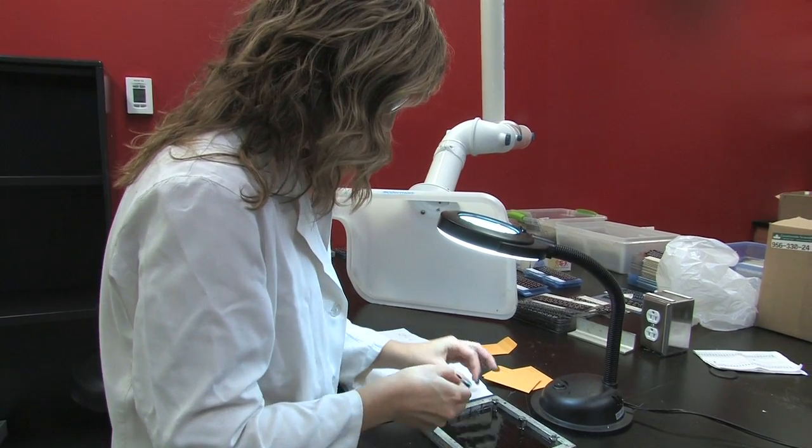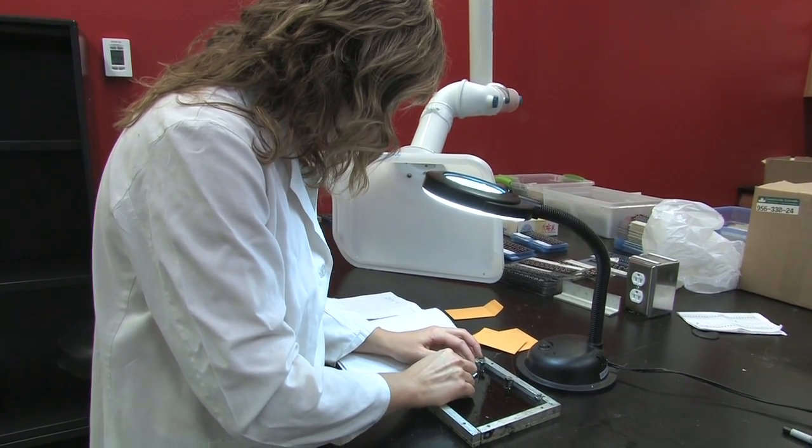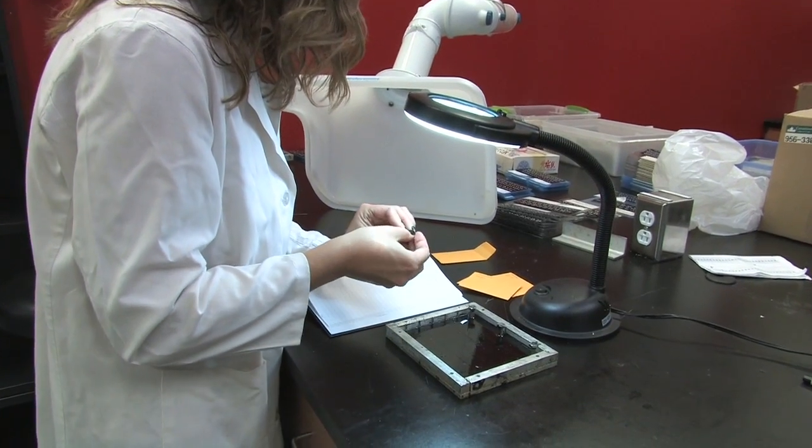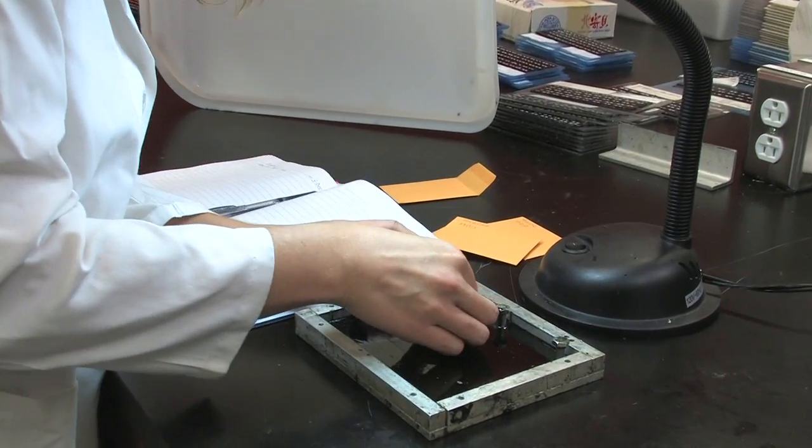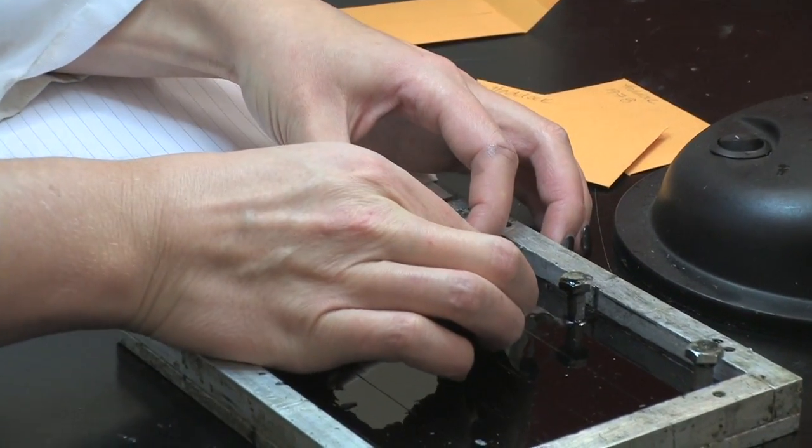Once the cores are marked the otoliths are then placed sulcus side or convex side up so the marked cores lie aligned on the etched lines. Place the pairs of otoliths on the embedding medium with the anterior or thicker end up and the posterior or pointy end down away from the screws on the tray.